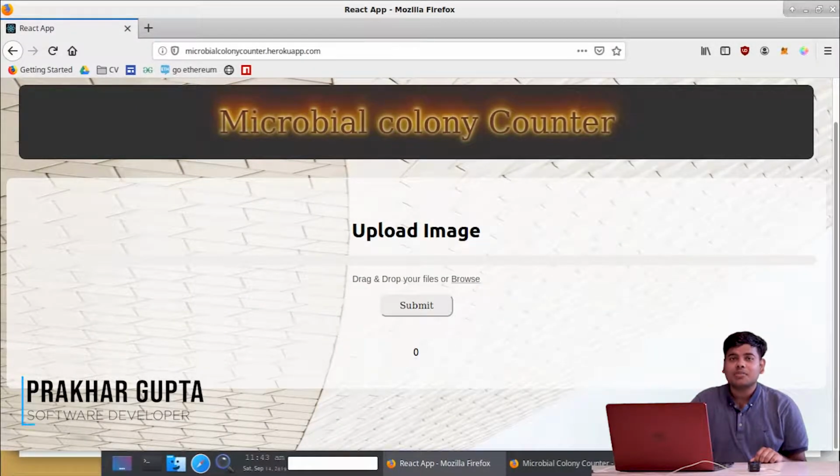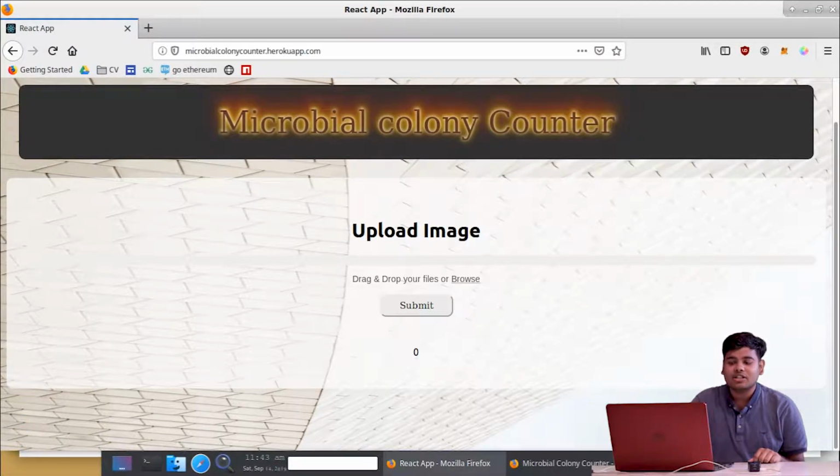Hi, my name is Prakhar, and this project is to automate the task of colony counting.